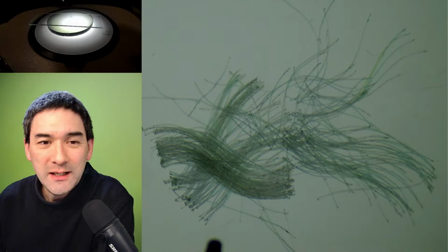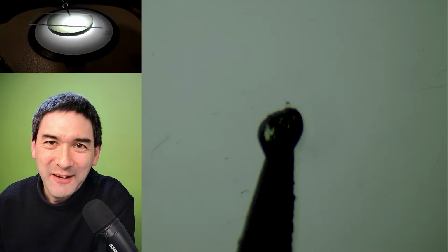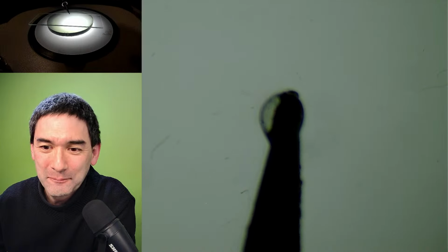Let's see what happens when I touch those. Look at this. I think the effect was very, very clear. It completely melted, right? If we want, we can try it again. I just need to take some tissue paper and wipe the soldering iron.